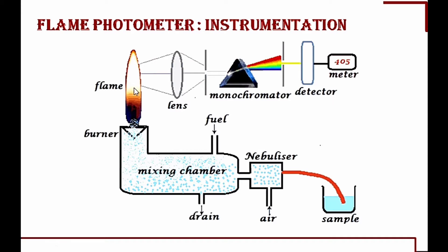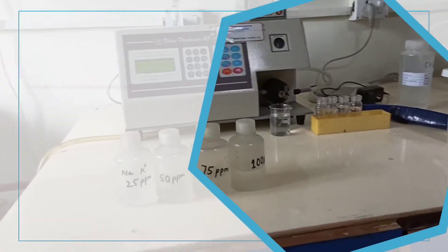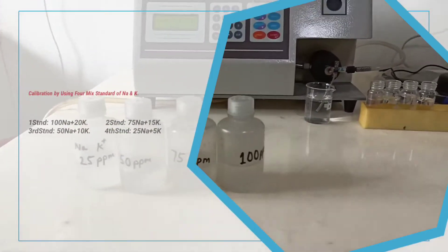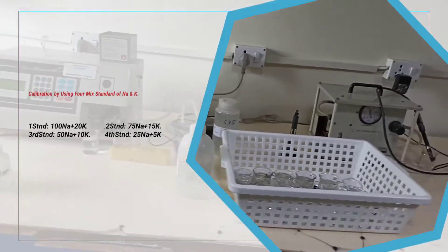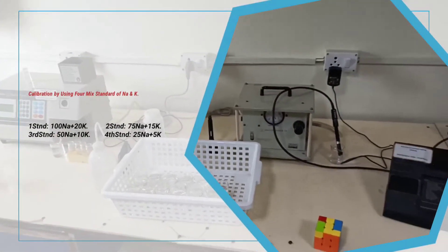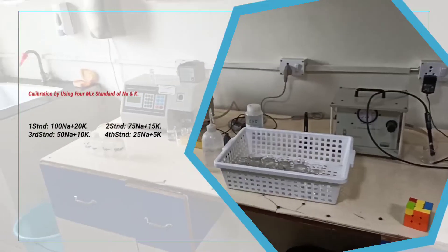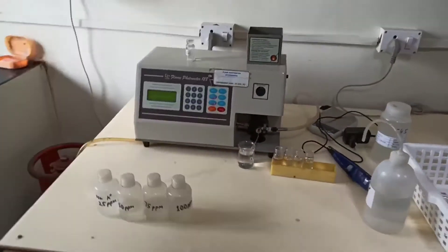Now let's move to how to calibrate the flame photometer. We have prepared five standards — these are mixed standards. In front of me you can see concentrations of 100, 75, 50, and 25. In the first standard, the sodium concentration is 100 and the potassium concentration is 20. We prepared the standards in that ratio.